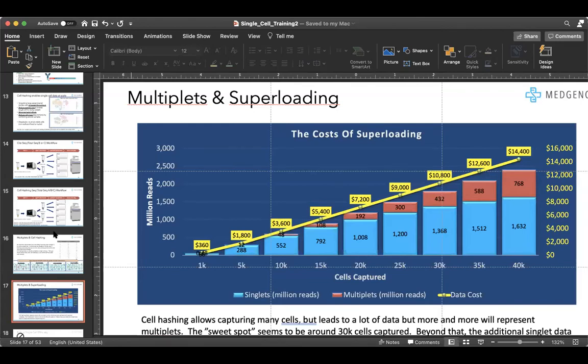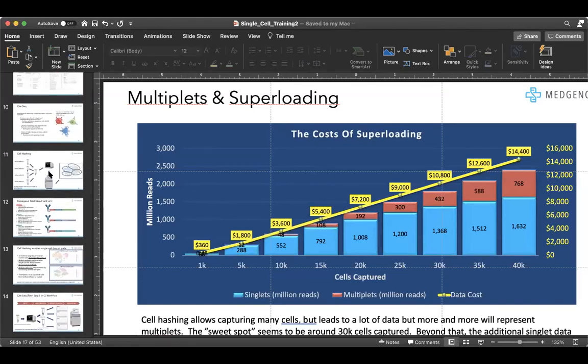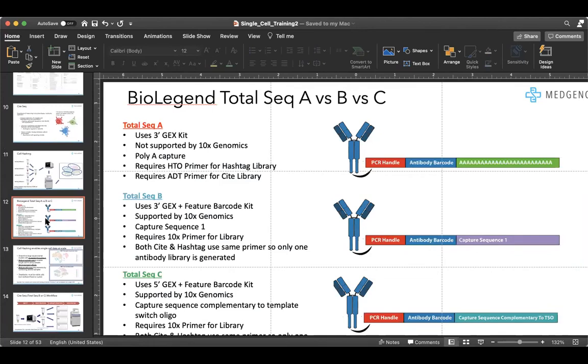Derek, this is Addy. Just a quick question around Cite and the specific antibodies. I would imagine that with clients that we're looking at, they would have very specific antibody needs as well, right? So, when we order these from 10x, is the question that we have to revalidate some of this again, or the fact that we have validated Cite just allows us to get the specific antibody in question and do the experiment for them, right? I'm just trying to get a sense of how replicable it can be or not, as we look for Cite customers.